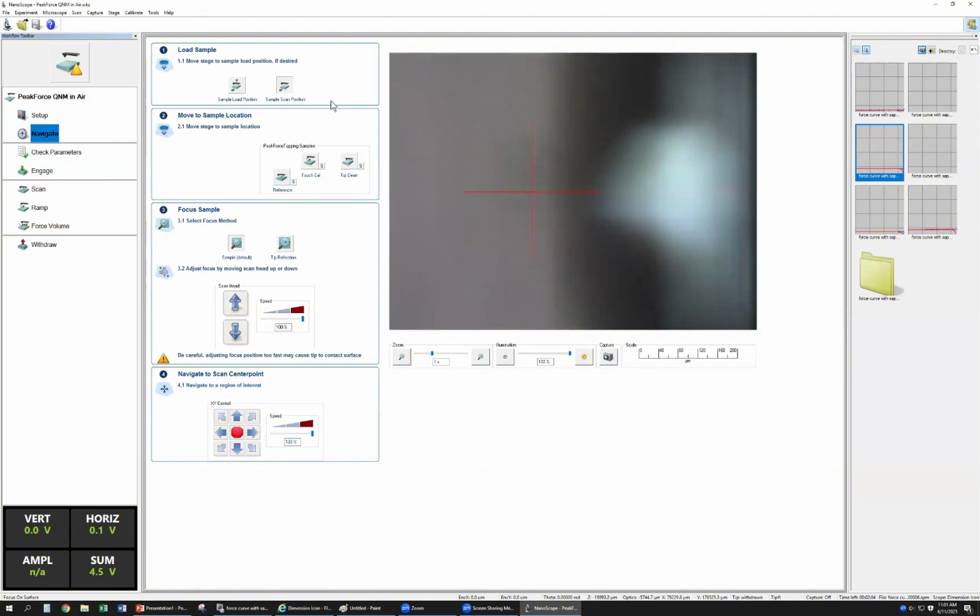It's quite hard. That means that with this probe we can measure the gigapascal material. So we use this one to measure the gigapascal material. Then we use the third sample.